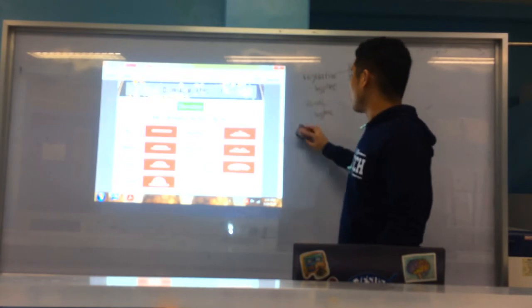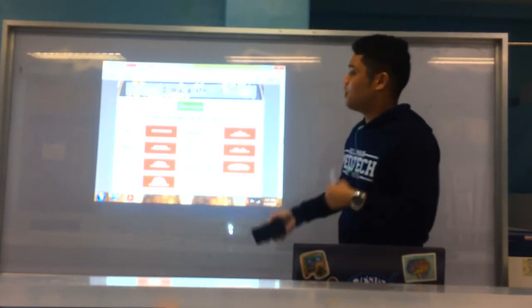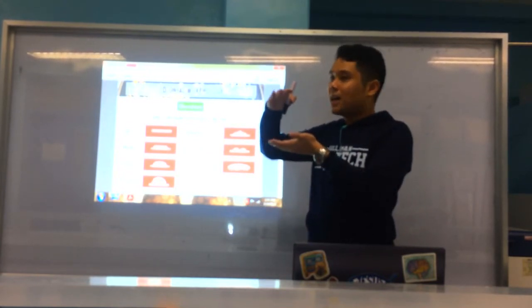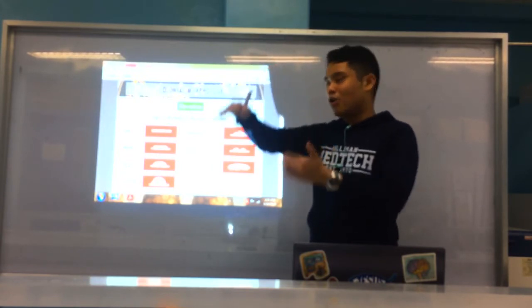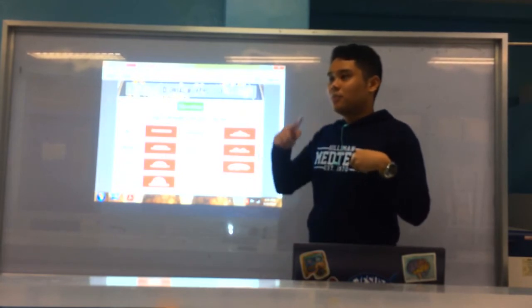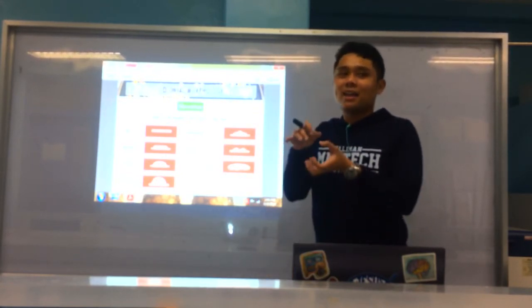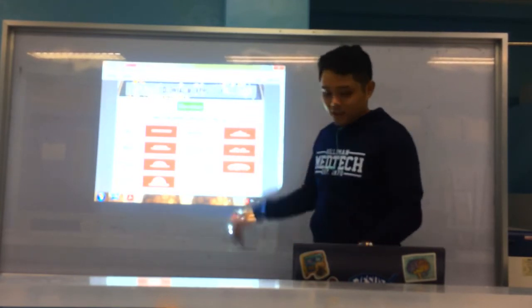So side view imong lantawon. Again, depende na nimo on how to describe it. Okay? It be flat ba, raised, medyo elevated gamay, convex, gipa elevate pa jud more, and then ang pulvinate kay medyo increase na good ang colony. Umbonate again murag boobs. Umbilicate is murag siya bulubundukin, yes naman, Sierra Madre. Okay. And growth into media like ni seep na gyud siya or ni kutkot na gyud siya sa media. Okay? All right, so that's for elevation.